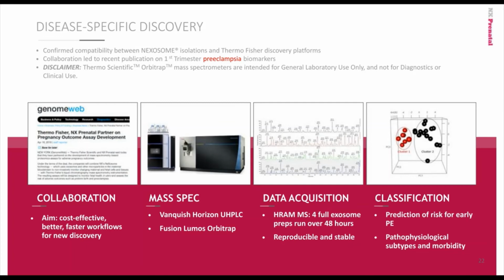Okay, this slide is just a reminder to reintroduce the preeclampsia collaborative study between NX Prenatal, Brigham and Women's, and Thermo Fisher. The preeclampsia study involved David Saraceno and the Brims. We used the same nexosome isolation protocol for particle isolation from a first trimester preeclampsia cohort.